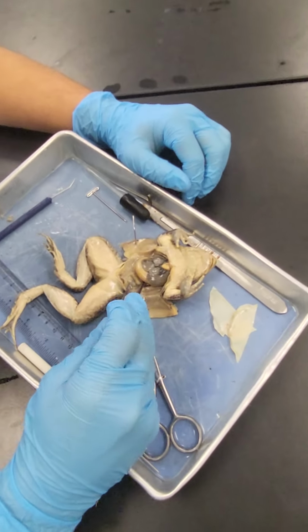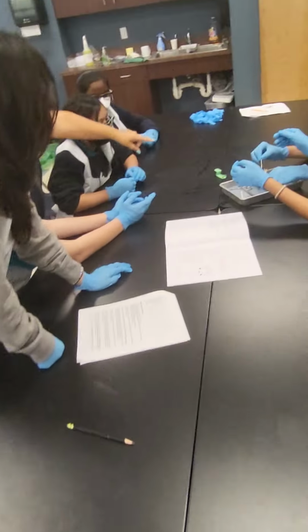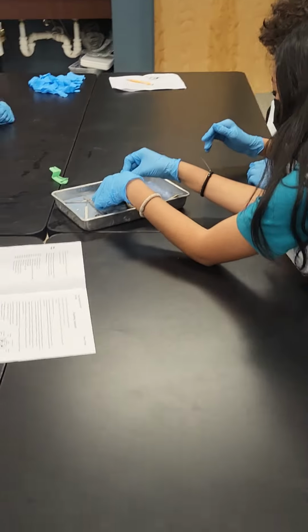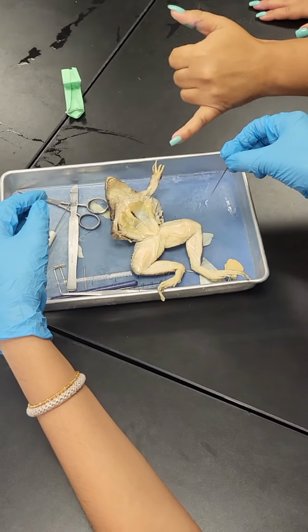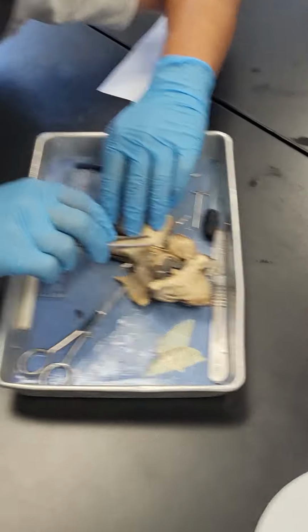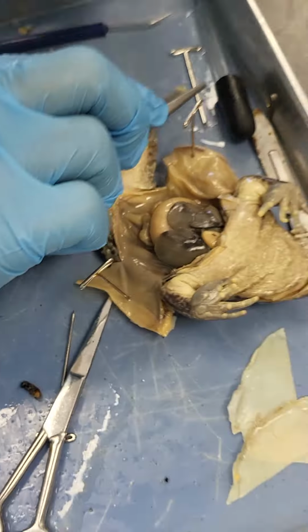Where do you see the egg? I can't tell. Is your frog pregnant? Where's the skin? Did you cut the skin off? You can take the muscles off now. Apparently it is eggs. Oh, it's liquidy. No, where's the eggs, though? I don't know. Are all frogs pregnant, Christopher?